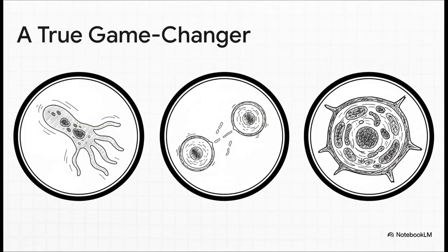And let me tell you, this was an absolute game changer. For the very first time, scientists could watch living cells completely unstained in real time. You could suddenly see all these incredible details in single-celled organisms, watch processes happening live. And the images you can get are just shockingly high quality for what is really a pretty simple setup.